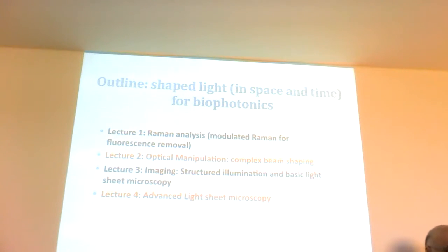The other thing is, you've got a wonderful set of lectures here, and you'll probably get bamboozled. Biophotonics has more acronyms than any other field I've ever seen. But the principles aren't all that different, actually. They're really quite simple. So keep your brain anchored in the principles rather than, should I use OCT or OCM or DHM or whatever it is. You can get your head in a tizz, but ask yourself, what do I want to measure? What is the scale level? What is the size? Those questions, and then fit the science around them. What science fits your question?